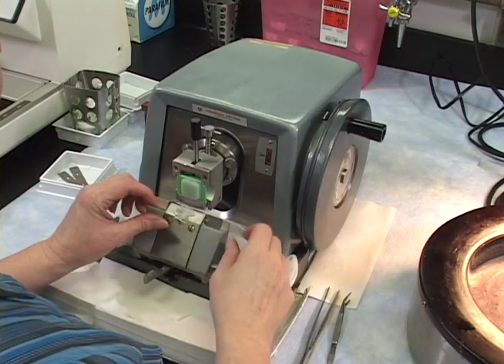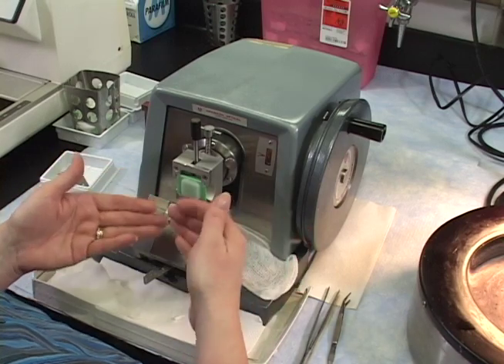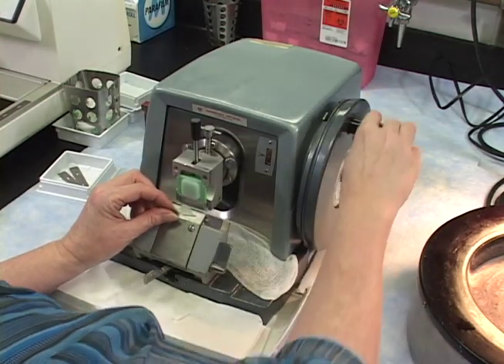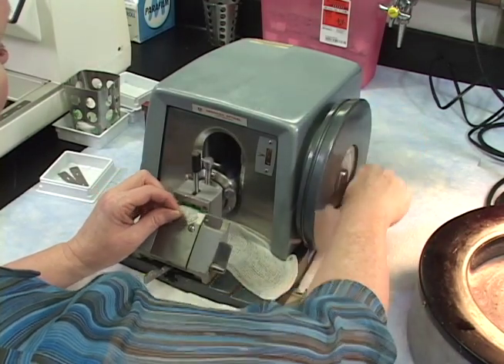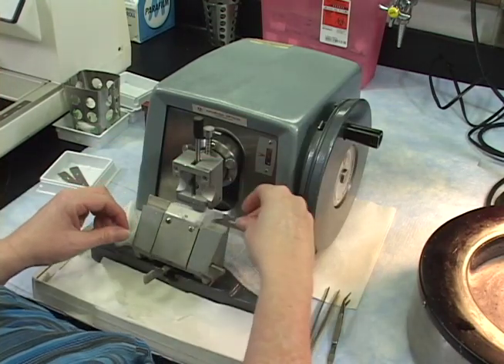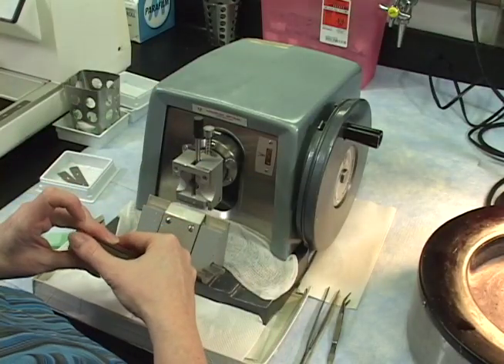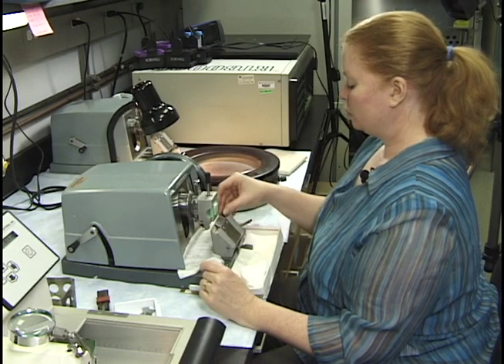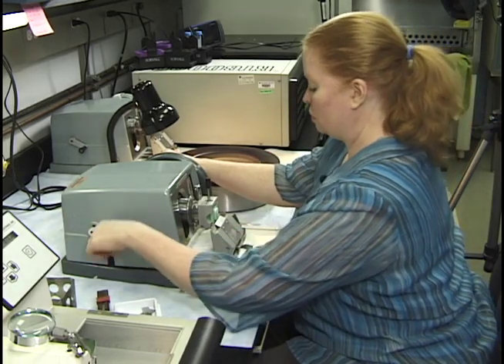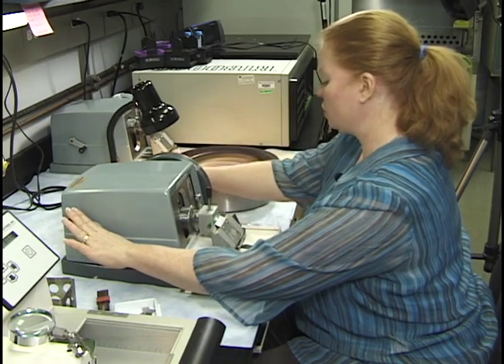Now you can see that this is my facing knife, so it has some knife lines and it's making creases and lines in the paraffin because it's obviously been well used. Let me get a new knife just to show you how smooth that's going to be. I'll get rid of that one. Okay. So I'm going to back it off just a little. So newer microtomes, it's better to do the full rotation when facing.